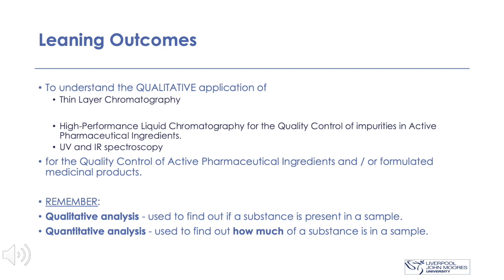Learning outcomes for this session is to understand the qualitative application of thin layer chromatography, high performance liquid chromatography, and UV and IR spectroscopy for the quality control of active pharmaceutical ingredients and formulated medicines.